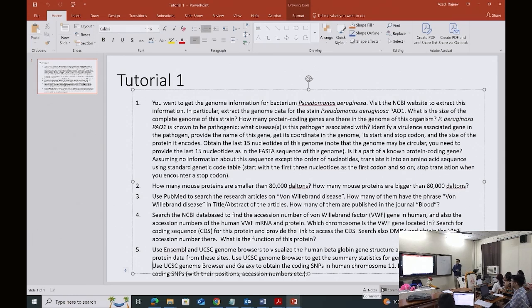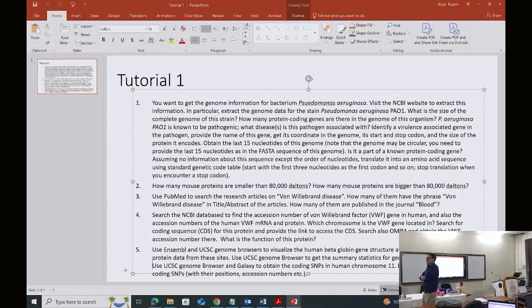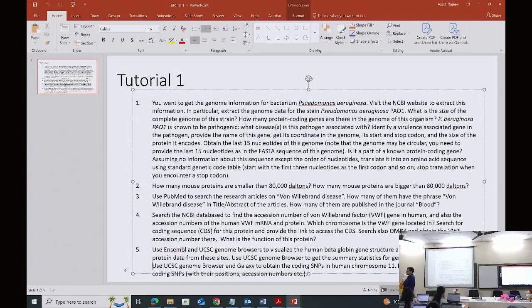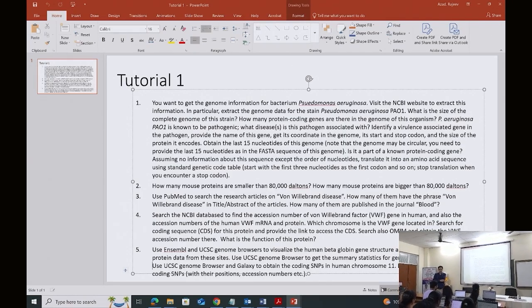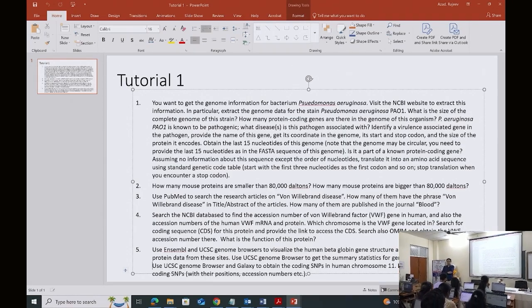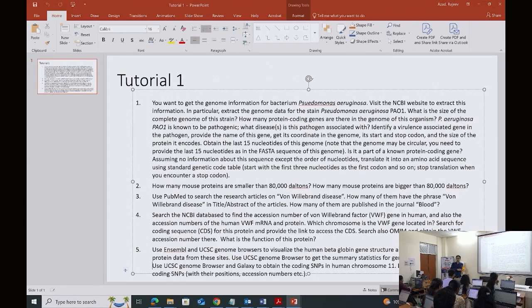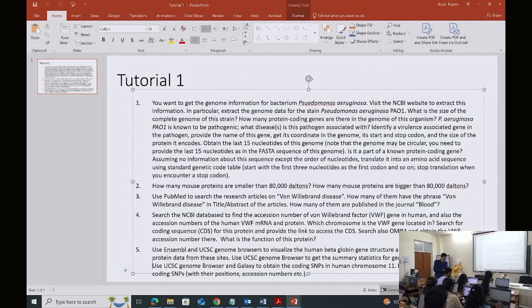So you all are trying the last part of question 5. Go to UCSC genome browser and then get the list of SNPs in chromosome 11, and then the list of coding exons in chromosome 11. Oh, you are still downloading. Okay.